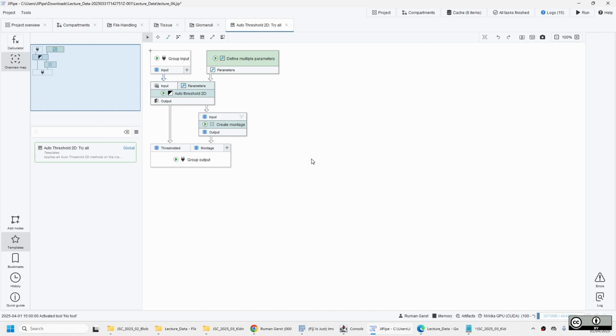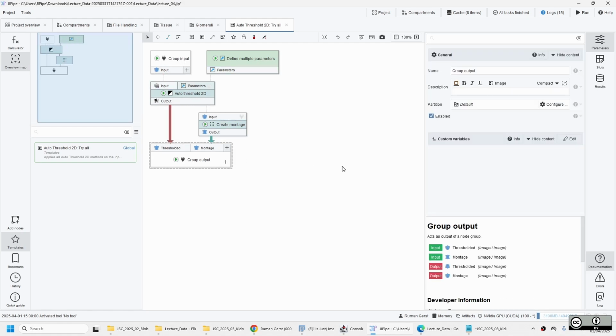They are basically like separate pipelines that you can open up, similar to how compartments are, but they're really fully separated from the other pipeline. And it basically has always a group input and a group output that behave similar to these compartments. So just use this to interface data between the outside pipeline and then whatever is inside the group.